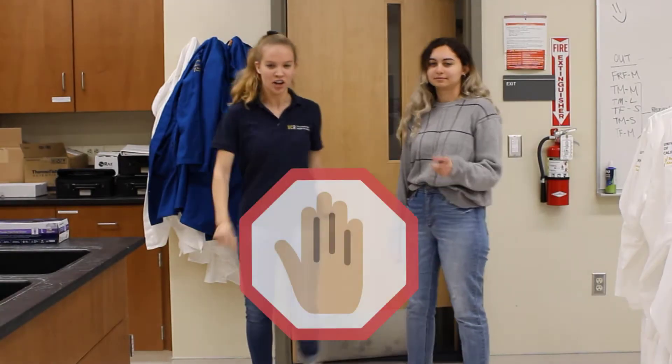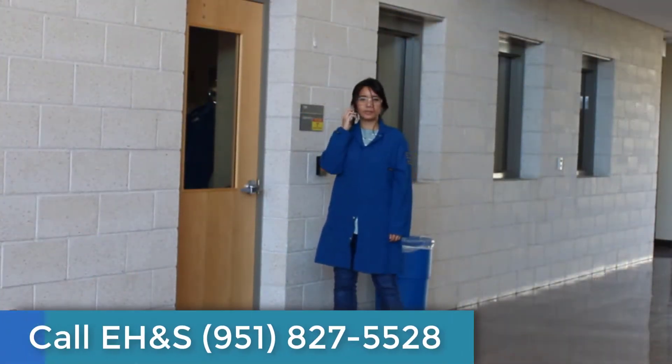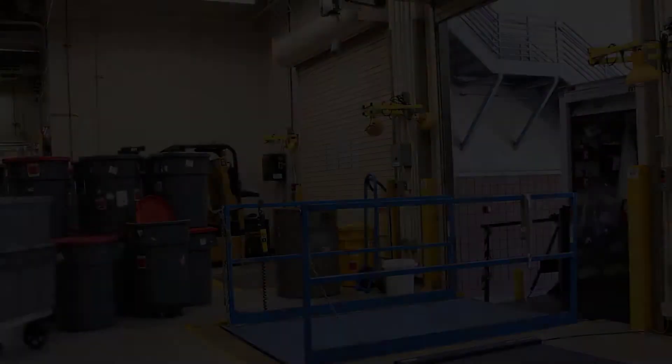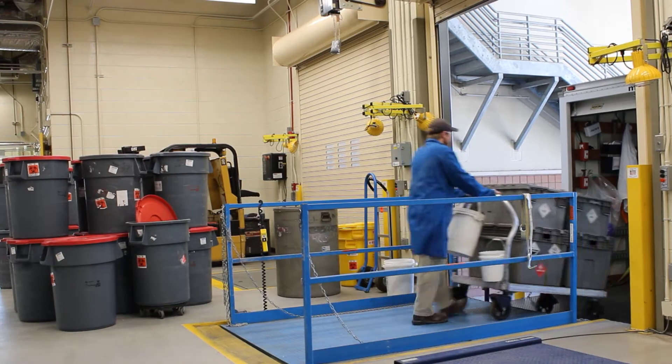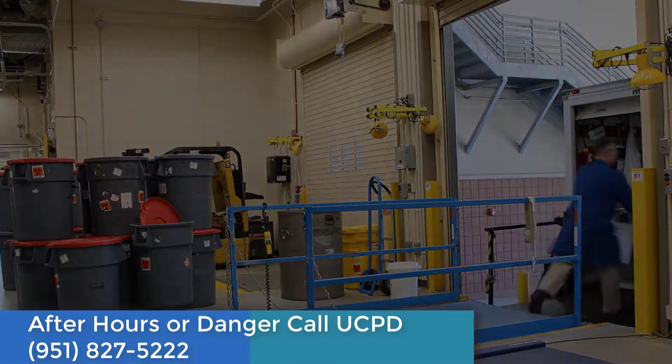Never enter a space you suspect to be contaminated. Call EH&S or UCPD for assistance and prevent anyone from entering the space. If you encounter any of these situations, call EH&S for assistance. For after-hours help, or if you believe you are in imminent danger, call UCPD.